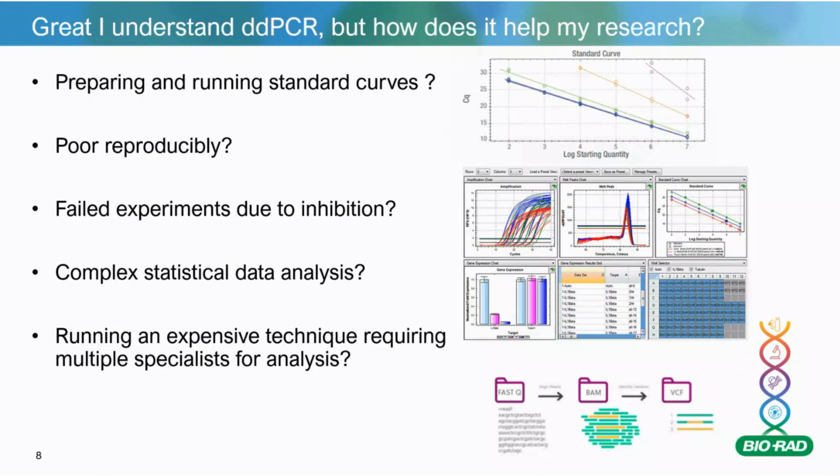Really, it's not a competing technology, not at all. They're two totally different technologies. In NGS, you're trying to find something novel or find a lot of information about a whole sequence. In Droplet Digital PCR, you're trying to quantify that information, see how changes affect its activity in the cell or something along those lines. But in Droplet Digital PCR, because it's just a type of PCR, the cost is much less than NGS. Also, the data analysis is much easier. In fact, the data analysis is a lot easier than even just real-time PCR.